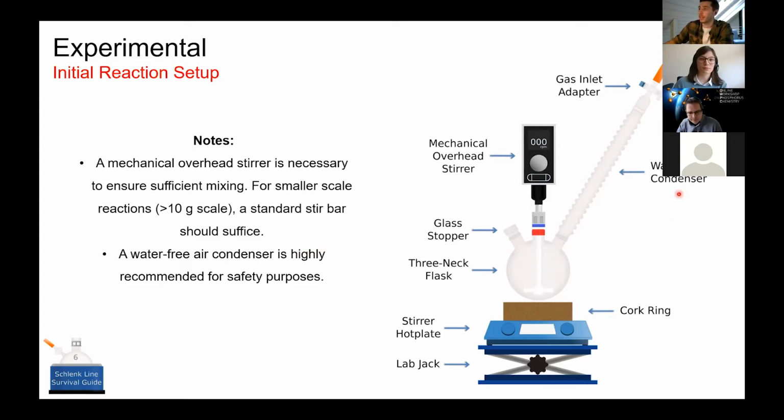A water-free condenser is nice here because it just avoids having additional tubing, which can make things a bit more complicated. And obviously, if we're working with very moisture sensitive compounds, it's just nice to know that there's no water even in close proximity to our reaction.